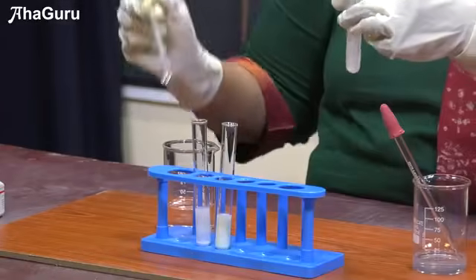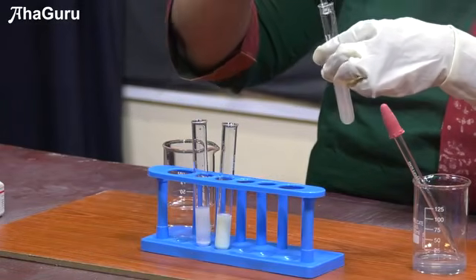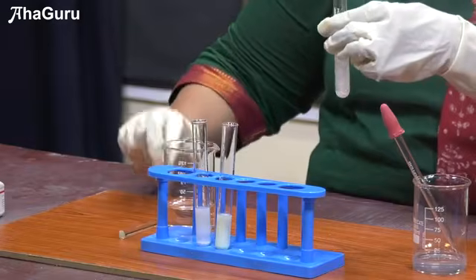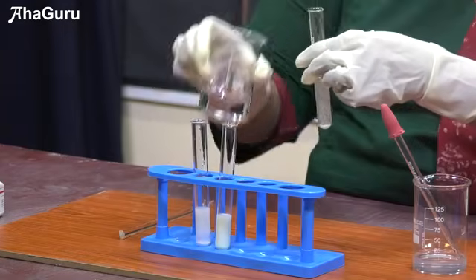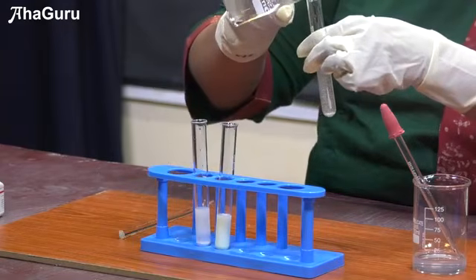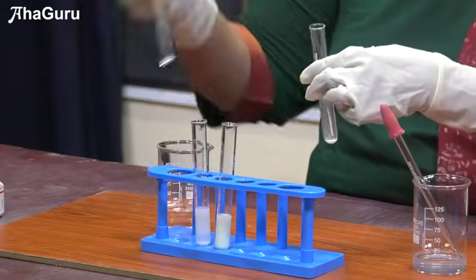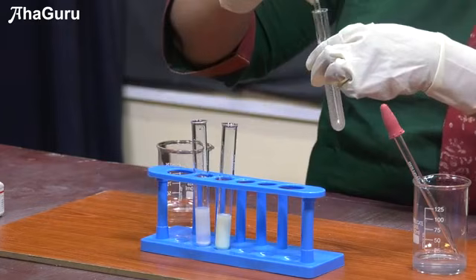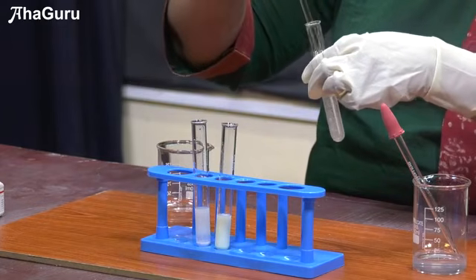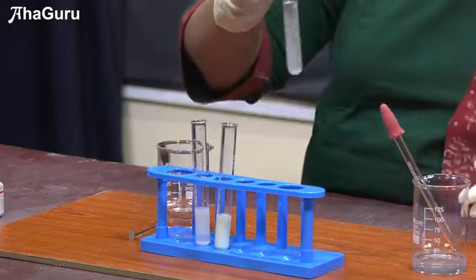As soon as we add ammonium hydroxide to the AgCl precipitate, you can see it is getting dissolved slowly. We can add some more ammonium hydroxide. You can see it's getting solubilized.